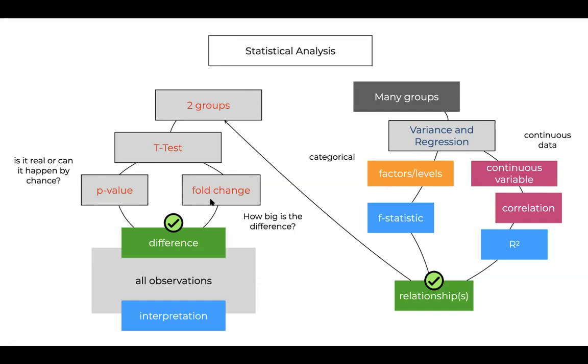So you need to understand the technical variation in your data. You need to understand the variation at the sample level. And then if you want to extract some common trends, it might include removing some samples from your data and using normalization to make sure that the assumptions you extract from the analysis are realistic in terms of your biological or biomedical interpretation.